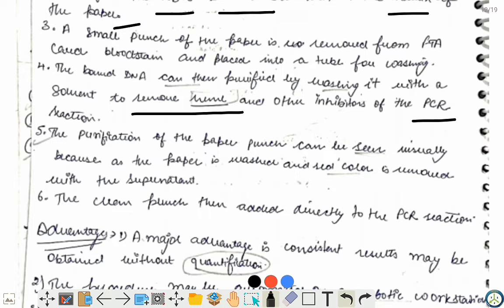Then after purification of the paper, the punch can be seen visually, and because the paper is washed, the red color is removed within the supernatant. Okay, so here what will happen is that the red color of the paper will be removed, and the clean punch is then added directly to the PCR reaction. Okay, so the clean punch that remains, we will directly add to the PCR reaction.